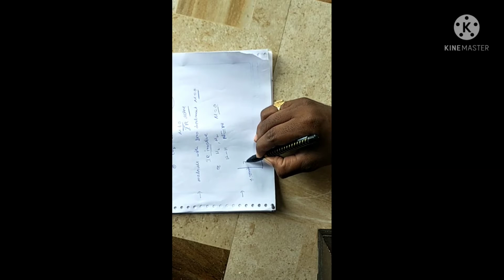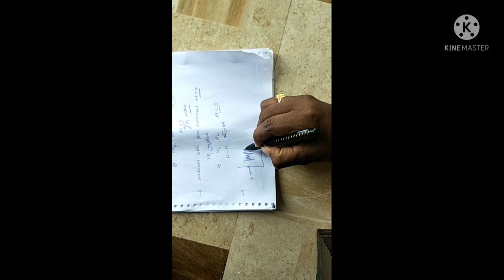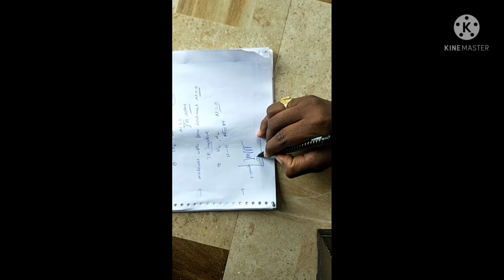We get the dips in the spectrum. These dips in the spectrum are called IR bands.